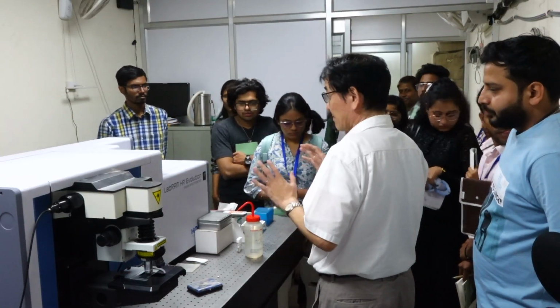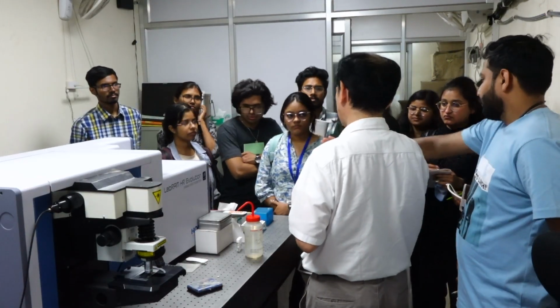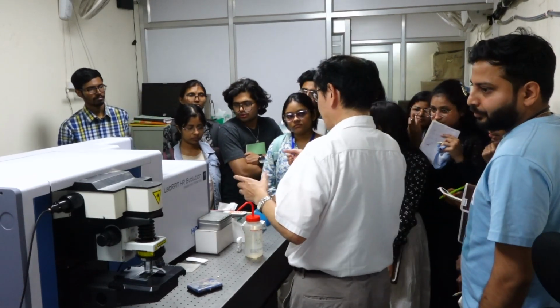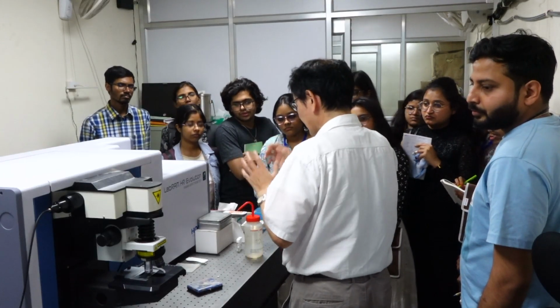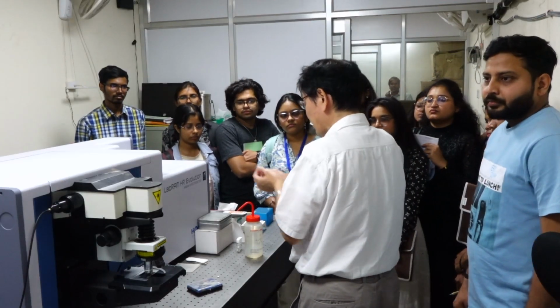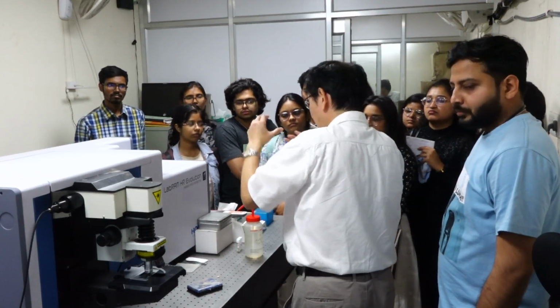So this is a Raman microscope. Okay, so for the Raman measurement, we need an excitation laser. The laser is transferred to the sample point. Then at the sample point, Raman scattering light is generated. Then that generated light will be collected and delivered to the monochromator.